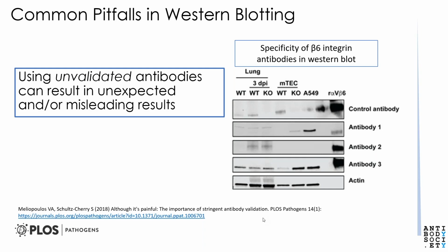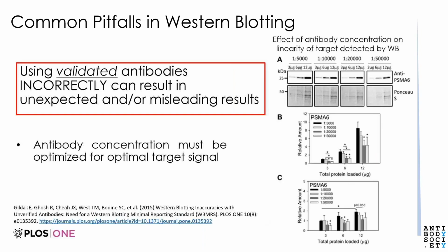It's very important. Otherwise, you end up with results which you cannot reproduce because the antibody you chose may not have been the correct antibody. Now, people assume that if they get a validated antibody from a company, they will get good results. In some cases, they would. But in some cases, that validated antibody, if used incorrectly, will give misleading results also.